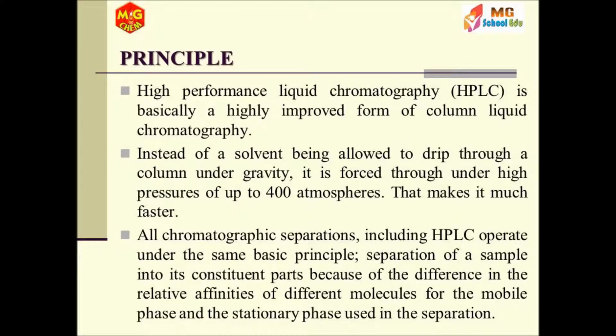All chromatographic separations, including HPLC, operate under the same basic principle: separation of a sample into its constituent parts because of the difference in the relative affinities of different molecules for the mobile phase and the stationary phase used in the separation.